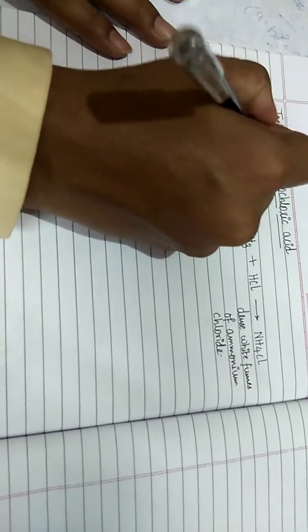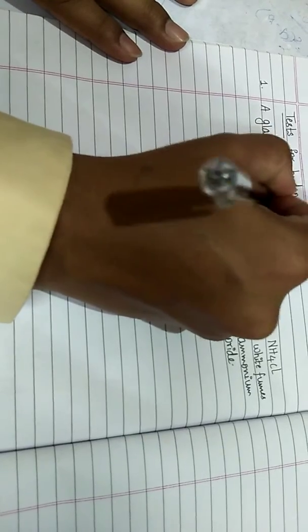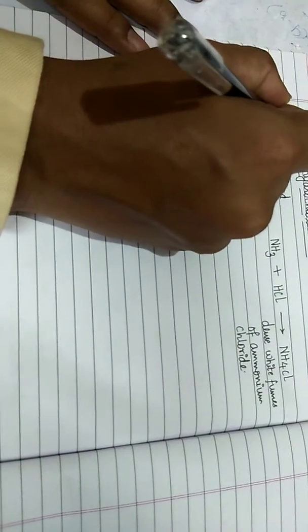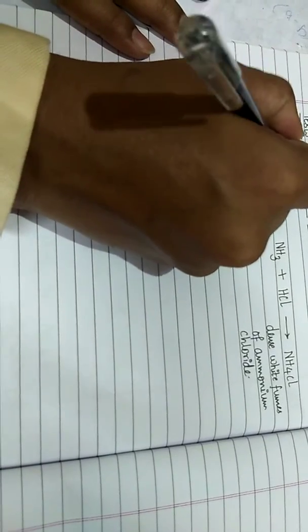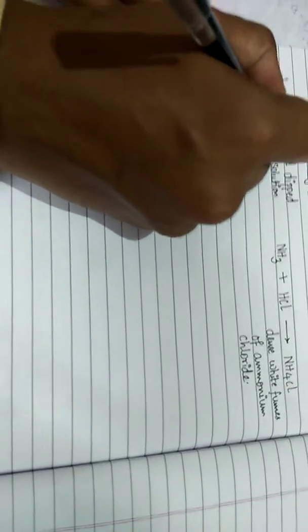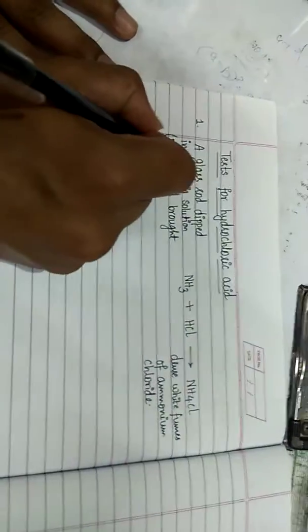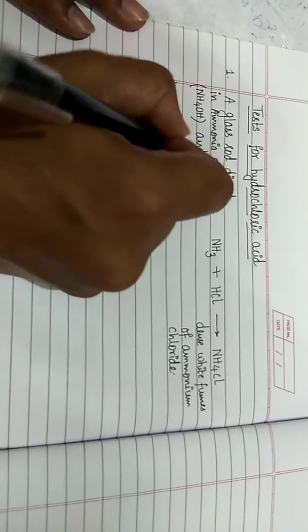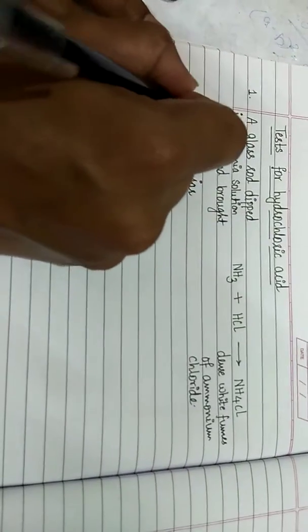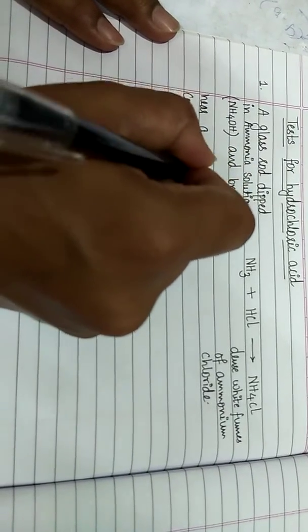So I'll write the test here: a glass rod dipped in ammonia solution, which is nothing but ammonium hydroxide, and brought near a gas jar containing hydrogen chloride gas.